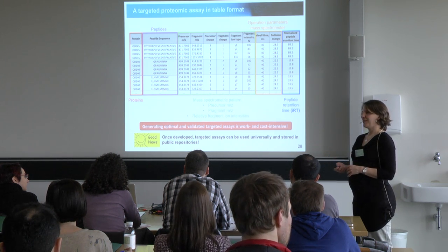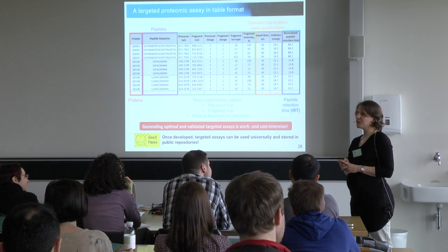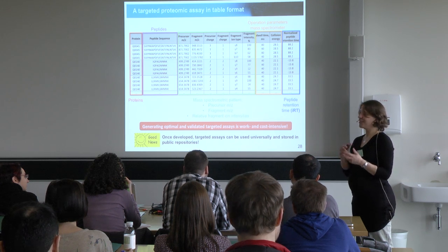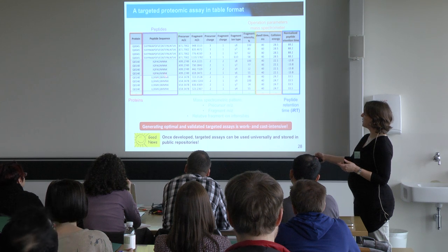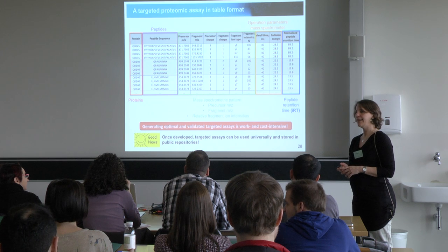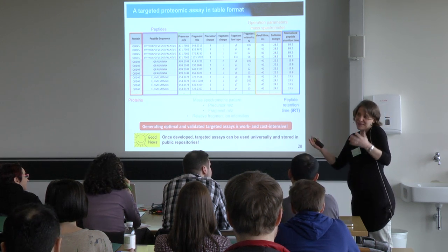And you would go rather for it than for them? You would go for, ideally you would go for all versions of it, the singly oxidized, the doubly oxidized, all combinations of it, because it's a different peptide whether this and this is oxidized or this and this, so you must make combinatorially all versions of it. Ideally avoid the methionines if you can.